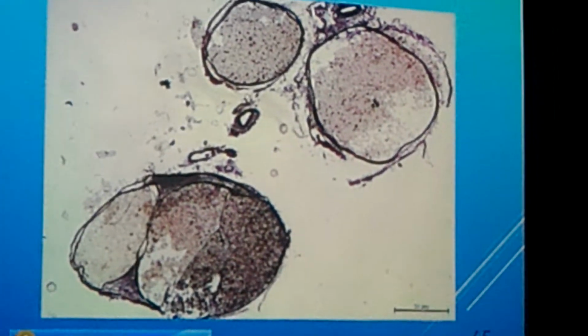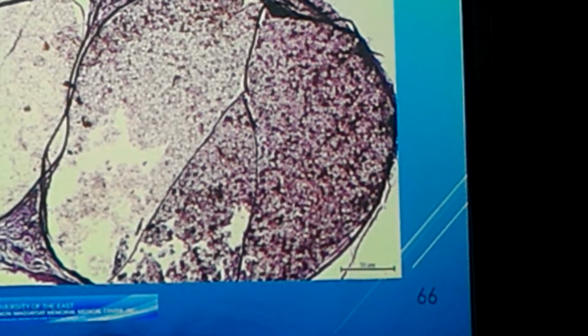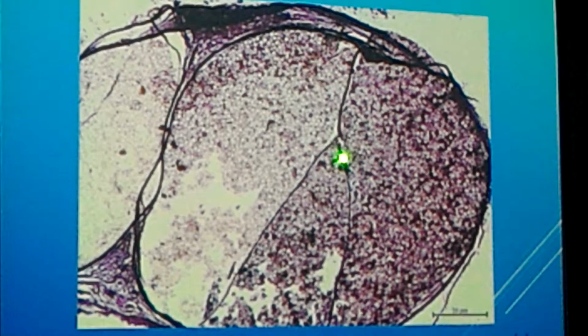Nerve trunk. This is your neuron, because it's a nerve trunk. Okay? Identify the pointed epi layer. Epi. Classify. Dense irregular. What is this, class? Very good. Perineurium.